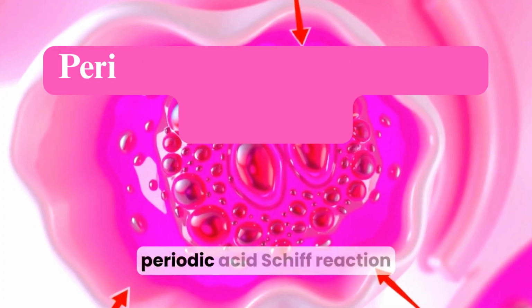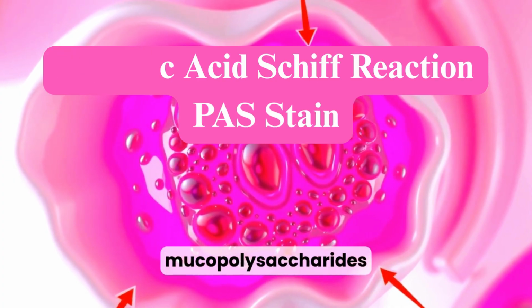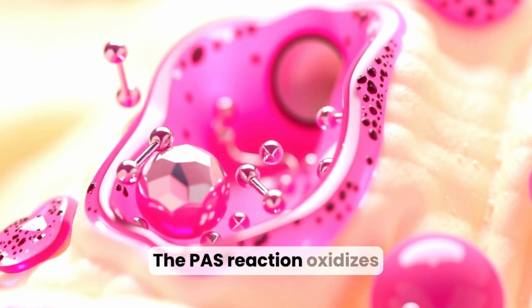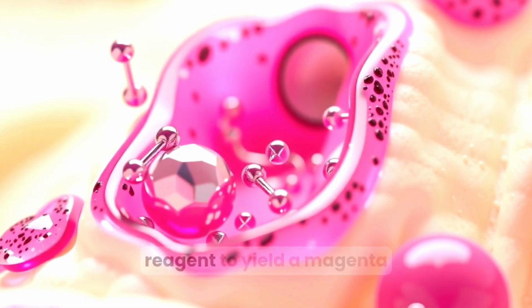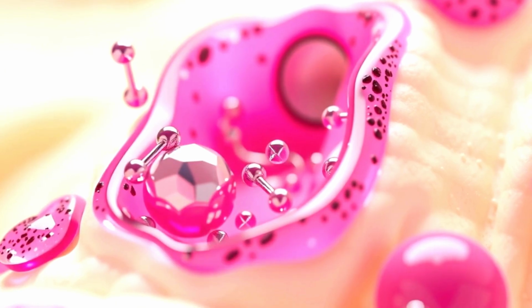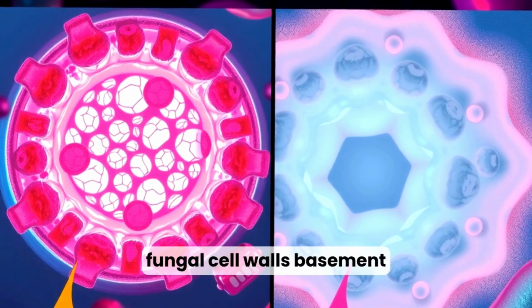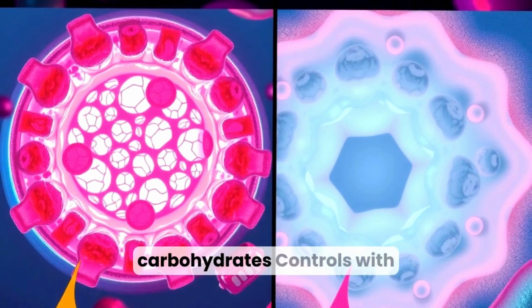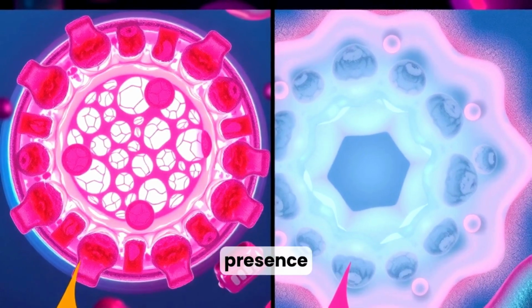Now we will look at the periodic acid Schiff reaction, used to demonstrate carbohydrates and mucopolysaccharides. The PAS reaction oxidizes carbohydrates to aldehydes, which react with Schiff reagent to yield a magenta color highlighting glycogen and mucins. PAS is useful for identifying fungal cell walls, basement membranes, and stored carbohydrates. Controls with diastase can confirm glycogen presence.